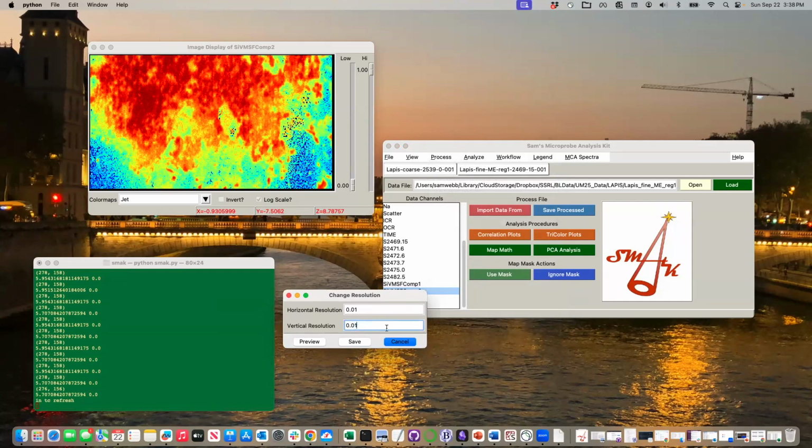And so if I don't do anything to change this, it will basically just resave the file. But this also resaves it in the current zoom. So if you find that edge removal really annoying, like I do all the time, and you want to save a file without that nasty edge, you can do your edge removal, change resolution, and save that data, keeping it the same, and you'll remove your edge for good into a new file. This is going to be important because we're going to import this file into the coarser one, and we don't want to have a big red line at the left side of our data. So I'm going to save this, even though it's not changing the resolution. I'm going to save it anyways.